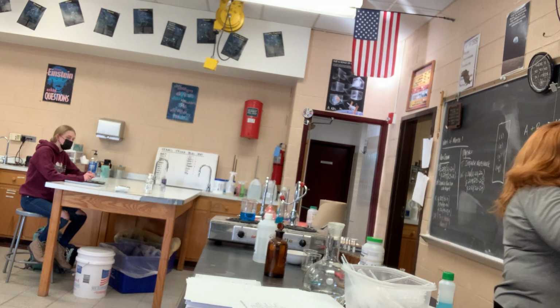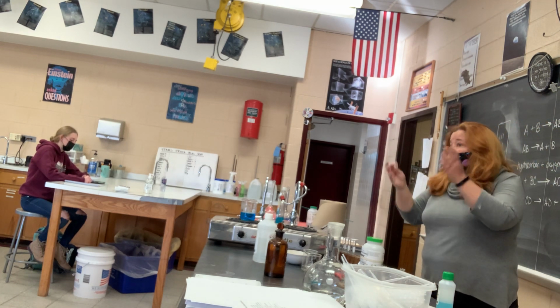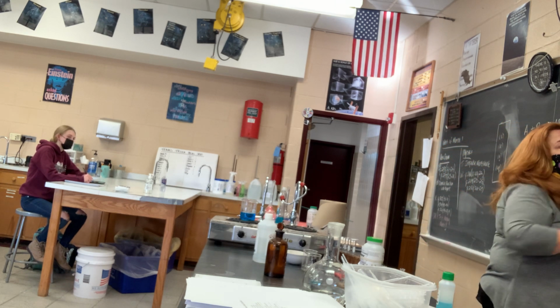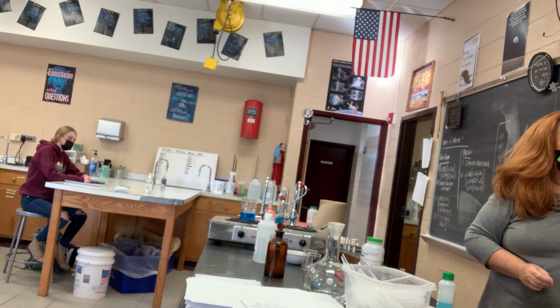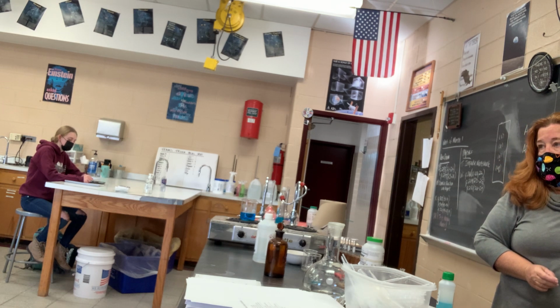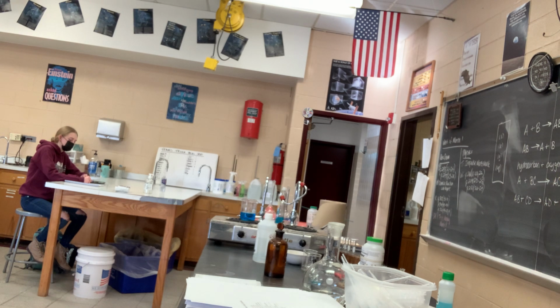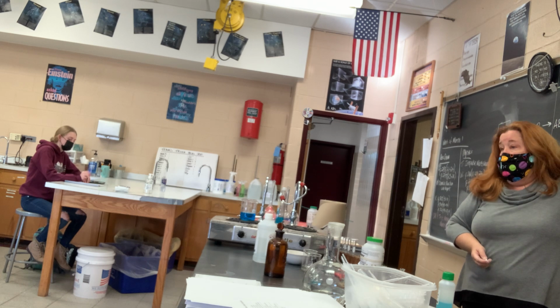So this is a single replacement. And there was a reaction, the bubbles, the heat, you could definitely tell there was a chemical reaction. So the zinc came in and bumped out the hydrogen. Zinc is a +2 charge. Chlorine, -1. This is the black stuff that was forming in the water. And then the hydrogen is a gas. That's what's by itself now, and it's diatomic.